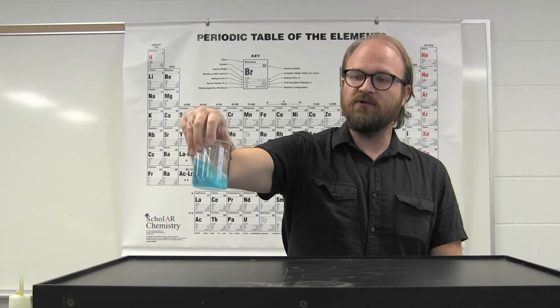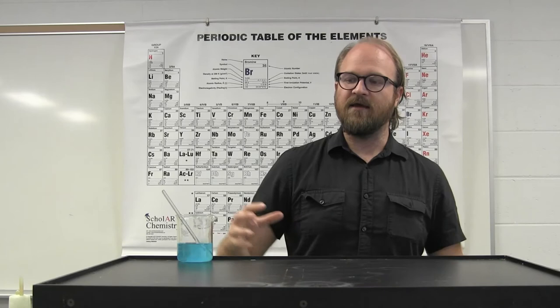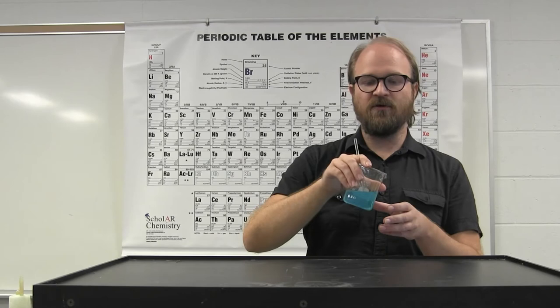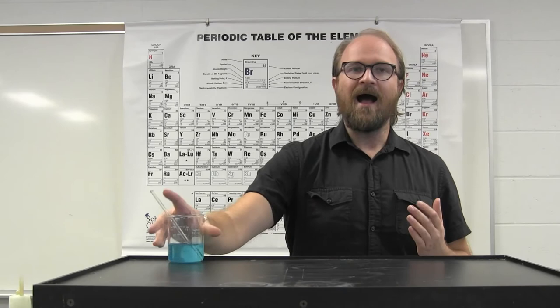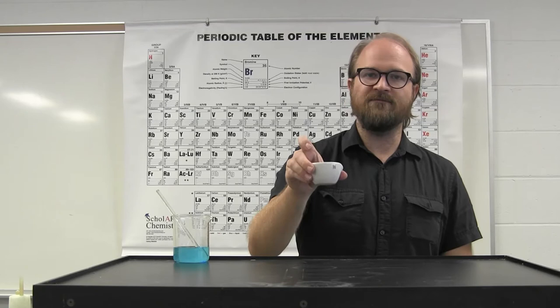When you're preparing solutions, you're taking that solid material, that solid compound, and dispersing it throughout a volume. Once you have the solution, you could then measure out a specific volume of this solution of known molarity and determine how many moles of compound would be contained in that solution. So if I measure this volume, I could see how many moles of copper sulfate I now have in these different portions.